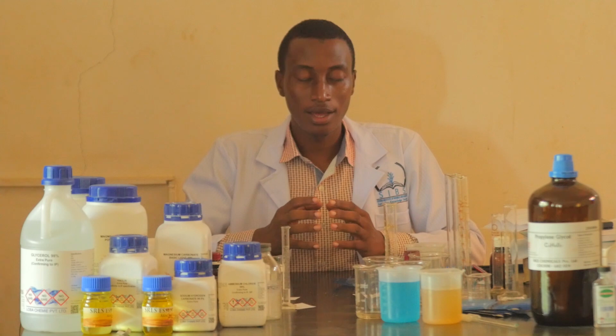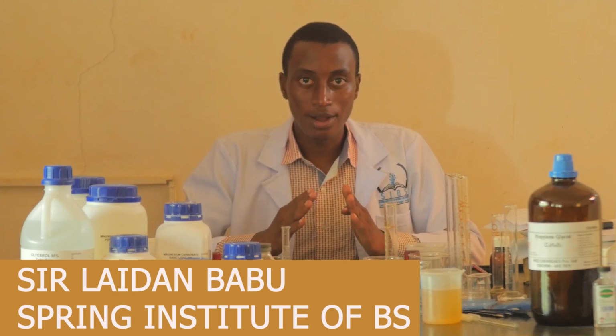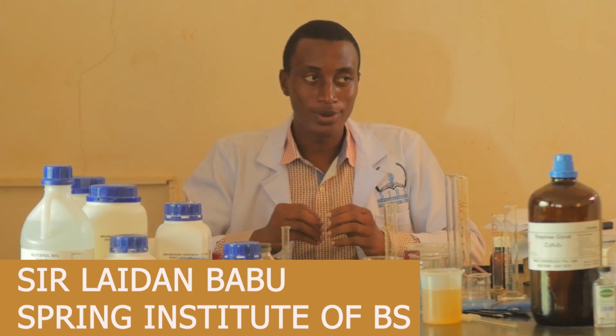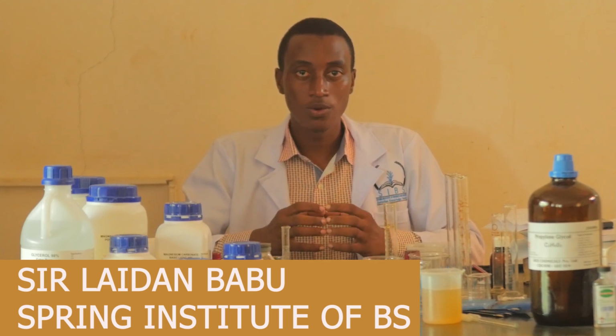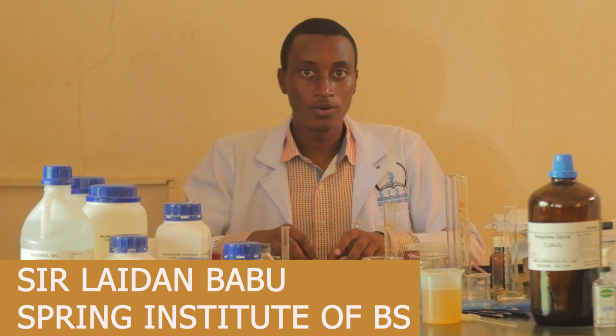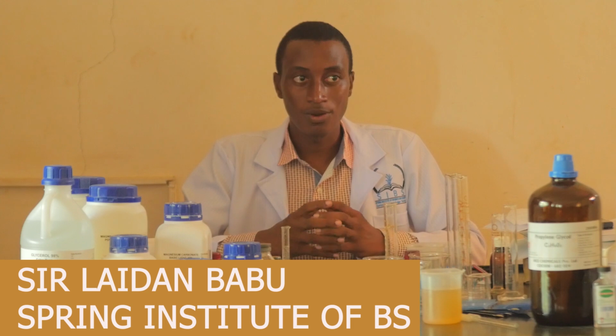Okay, it's another day. Now we are going to look at how to prepare iodine tincture or weak iodine solution. Before, we had a session on aqueous iodine solution, but today we are going to look at the minor difference between aqueous iodine solution and weak iodine solution. In aqueous iodine solution, you saw the vehicle was purified water, and now in weak iodine solution or iodine tincture, the vehicle is alcohol 90%.